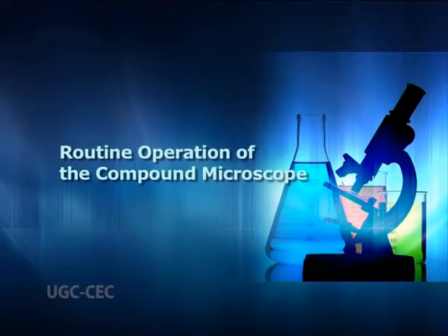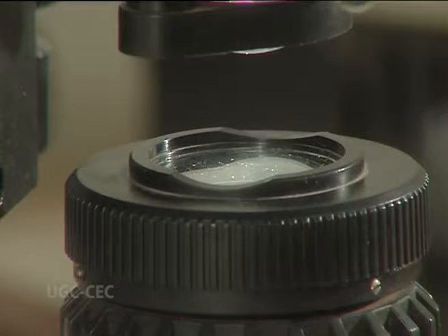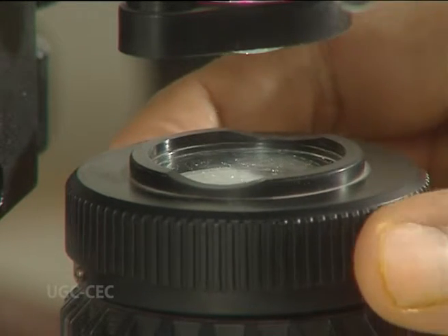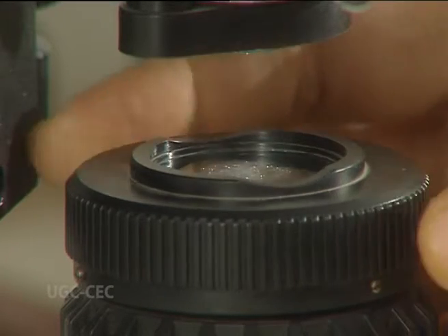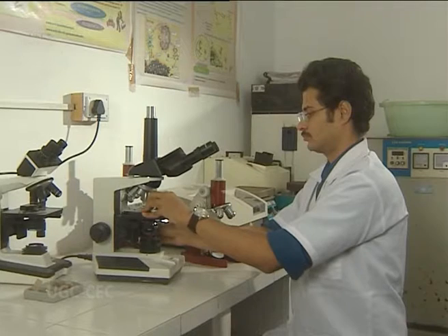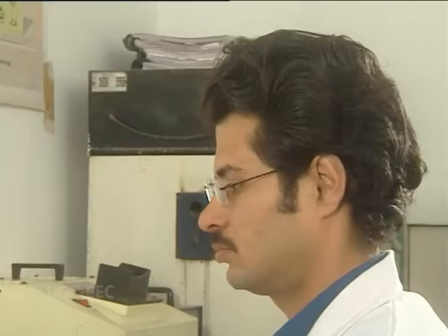Routine operation of the compound microscope. Ensure that the voltage supply in the laboratory corresponds to that permitted for the microscope. Use a voltage protection device if necessary. Turn on the light source of the microscope. With the light intensity knob, decrease the light while using the low magnification objective. Place a specimen slide on the stage. Make sure the slide is not placed upside down. Secure the slide to the slide holder of the mechanical stage.